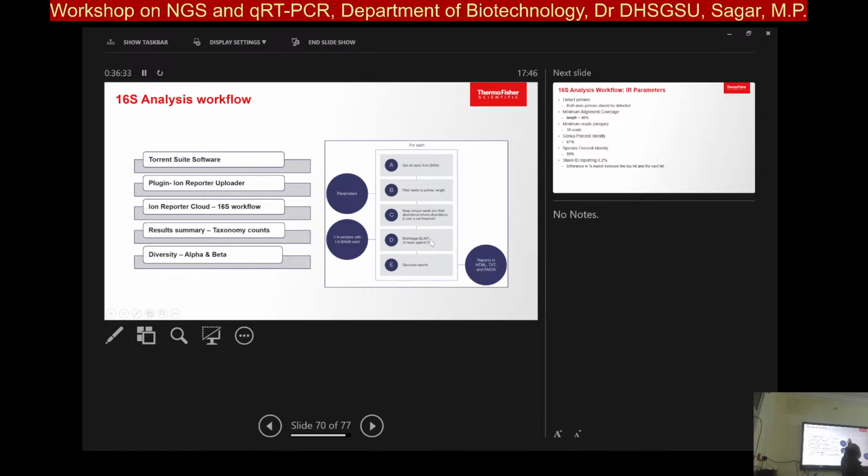The workflow is more like taking your reads, looking for primers. Both the primers है कि नहीं, V2 region, V4 region, V8 region, V6, 7 primers होने चाहिए, तो ही वो आगे पिक होंगे, तो वैलिड रीड्स है. अगर प्राइमर्स है तो वैलिड रीड्स है. यही वैलिड रीड्स आगे जाके क्लस्टर हो रहे हैं, क्लस्टर्स. If they are getting clustered and counted, those clusters individual that are there, call it as OTU, operational taxonomic unit, and that should be about 10 reads. वो काउंट है, मिनिमम काउंट. अगर वैसे रहेंगे तो ही वो क्लस्टर आगे यूटिलाइज करेंगे फॉर असाइनिंग अ रेफरेंस, असाइनिंग अ टेक्सोनॉमिक.